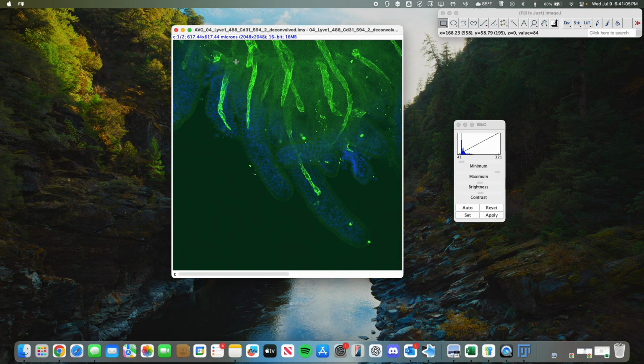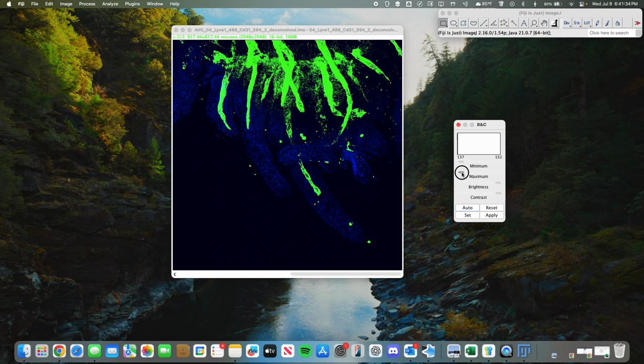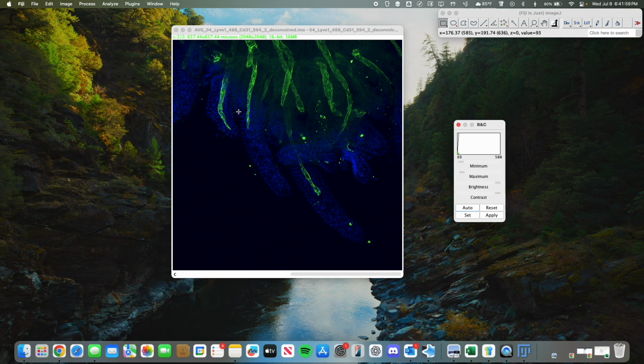for quantifying these lacteals. And as you can see, the lacteal ratios are what we're trying to quantify, but we have an abundance of various villi moving throughout different places, and it does take quite a while to get used to figuring out what is what and how things move. I think we can do a little bit of modification to the green channel, and look, I did a pretty good job here of removing any of the extra, but I do want some. It's okay if we have that. We'll go ahead and yeah, so I think this is pretty good.